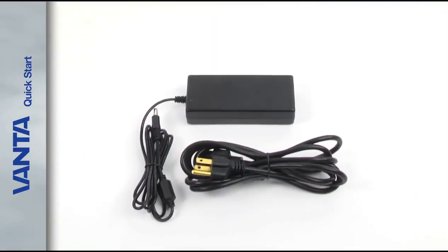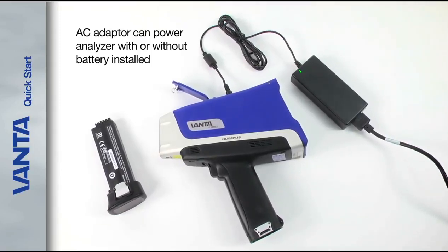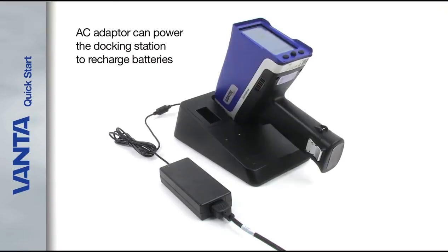Every Vanta comes with an AC adapter. This can be used to power the Analyzer with or without a battery installed in the handle. The AC adapter can also power the docking station to recharge the battery installed in the Vanta and the spare battery in the docking station auxiliary socket.